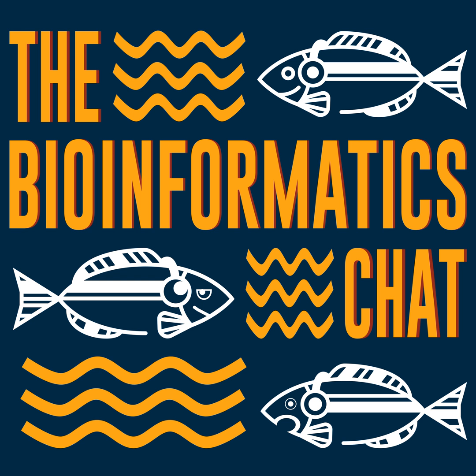That's true. And the idea of Flye is, given the set of reads, we can generate a set of draft contigs. We call them disjointigs because they are less accurate than the contigs that you get at the end of the assembly process. We construct these draft disjointigs using a greedy approach. We simply take a random read and try to extend it left and right based on the overlaps.